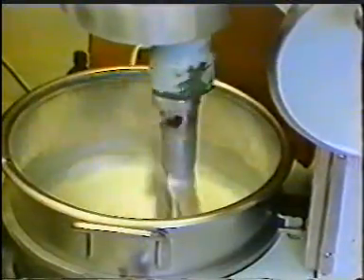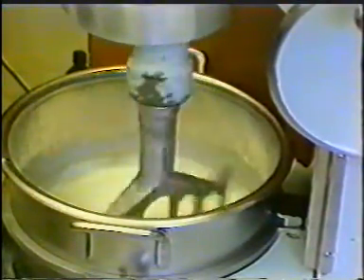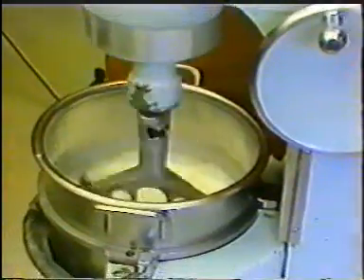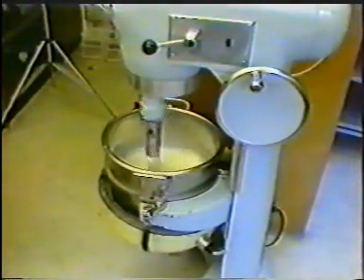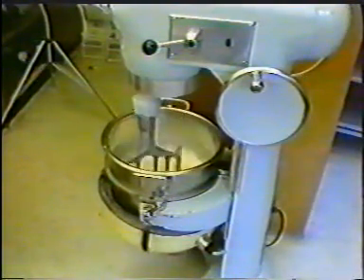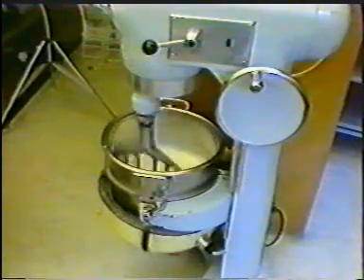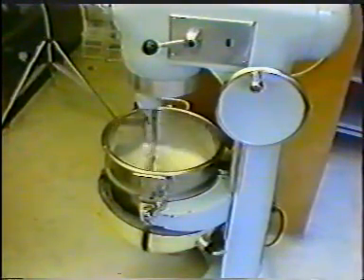In the course of batch manufacture, a bulk product is obtained. Sometimes tests are carried out on the bulk product before packing, for example to check the concentration of active ingredient or whether mixing has been thorough. However, this is more commonly carried out in industry where much larger batch sizes are involved.